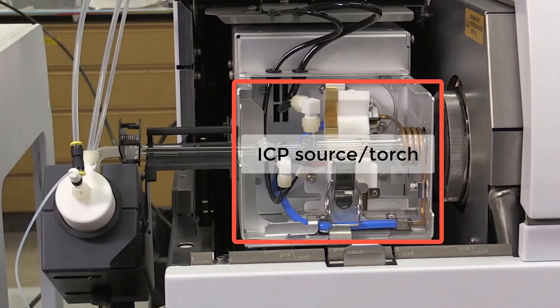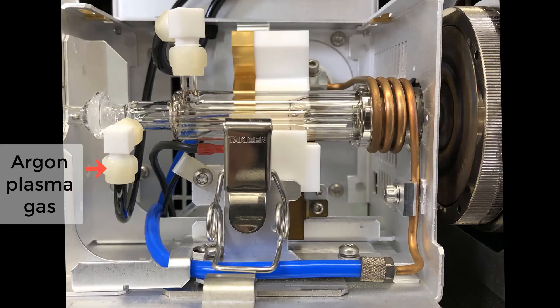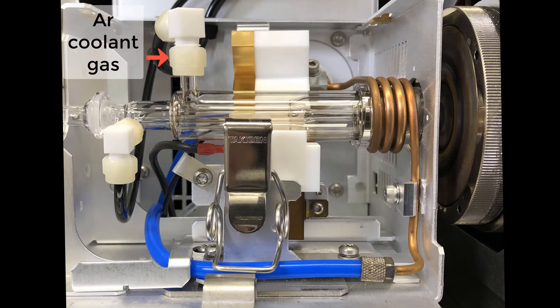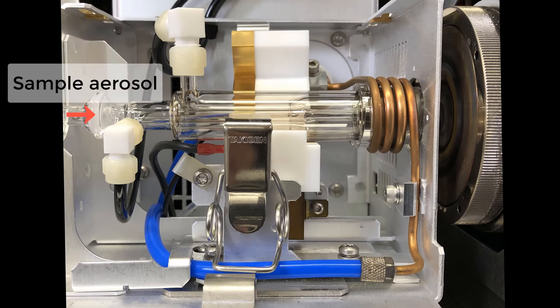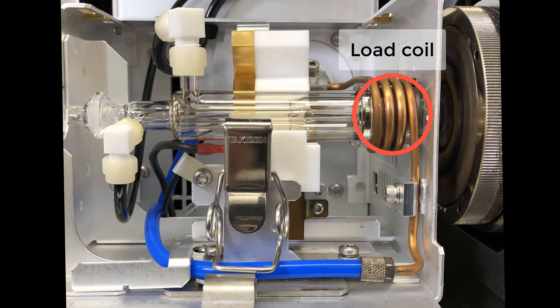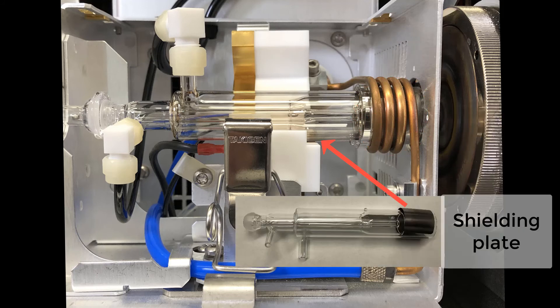Components of the torch include: argon source, coolant gas, sample introduction, load coil, bonnet, and shielding plate.